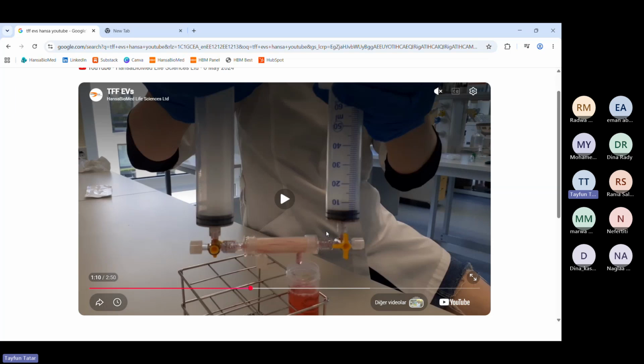You don't need to have a peristaltic pump or the automation device that we built. The automation is more useful when you are processing much larger volumes, because if you are processing a couple of tens of milliliters, you can easily inject it with a syringe. But if you want to process 1 liter, or tens of liters, it is not possible to inject it with syringes. That's where the requirement to automate it kicks in. I hope it is enough. If not, I can further clarify.